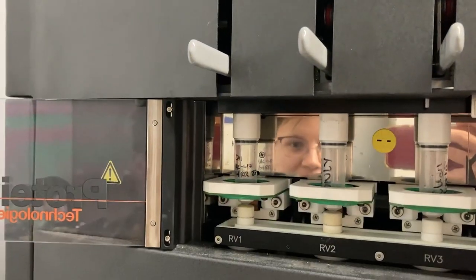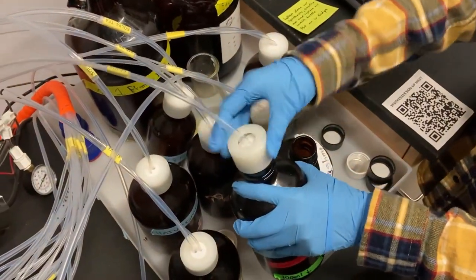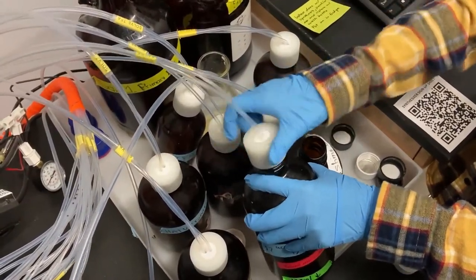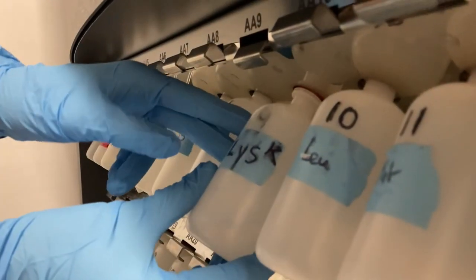Attach the filled reagent bottles to their respective lines and push the amino acid bottles back into place by pushing from the bottom until you hear and feel a click.